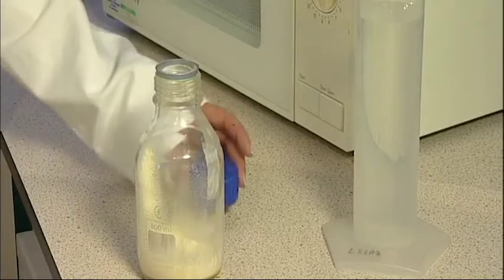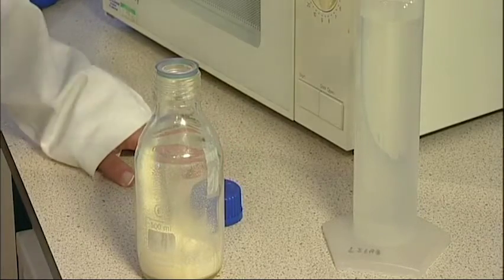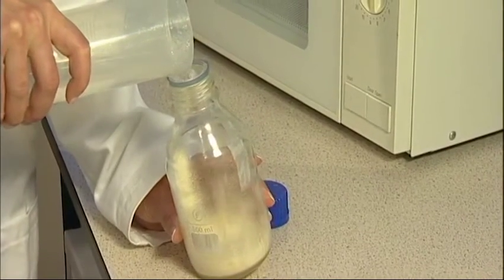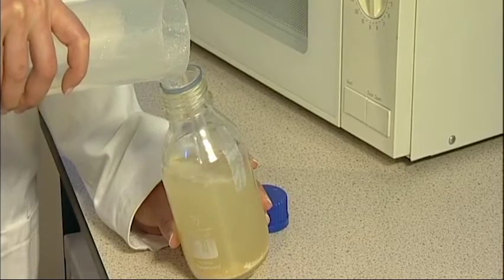If you have a microwave, you can use it to melt the agar. Put the agar in a microwave-safe bottle. Add 500 ml of deionized water. Close the lid and shake it to mix.